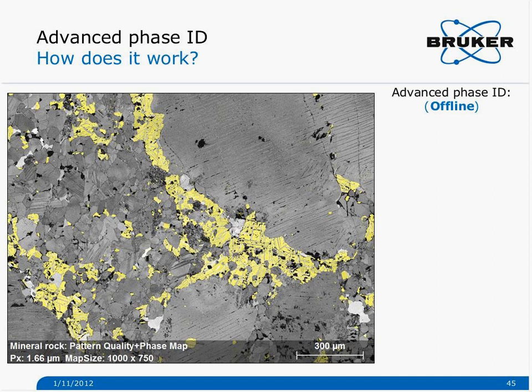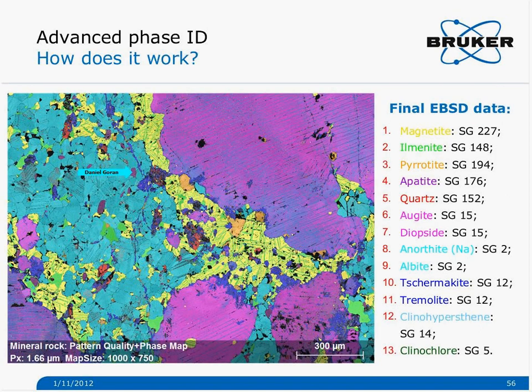And then, of course, one can use the EBSD detectors, both the high speed or the high resolution detector, in a higher resolution mode, but that of course will affect the speed at which you acquire the data. And if the speed is not an important factor for you, then there is no problem with that.